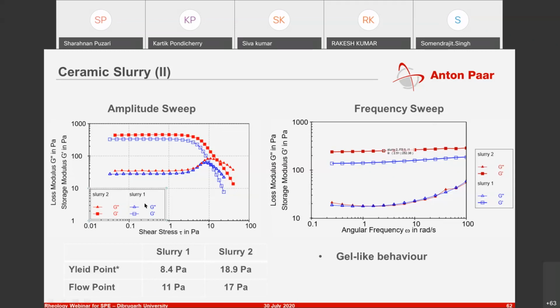Why is that? You can imagine that if you have spherical powders, they are a bit easier to make flow, like they offer lesser resistance. But imagine if you have these platelets, like these plates forming around, and then to push them at higher viscosity or higher shear rates, of course, you will have an easier flow because they try to align themselves with the extreme force that you're applying. But just to start making it flow, you would need a much higher stress or much higher force.